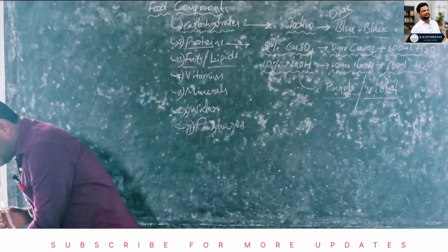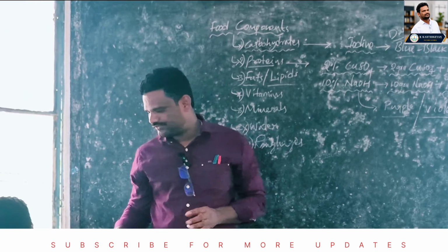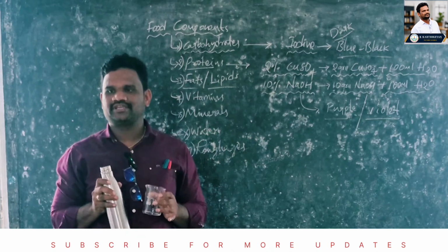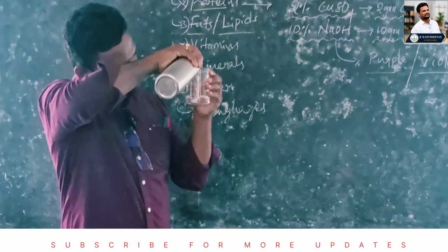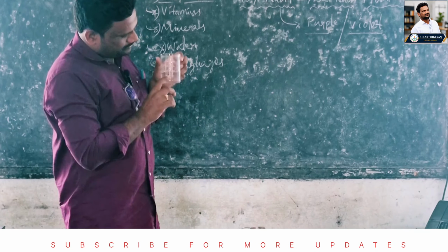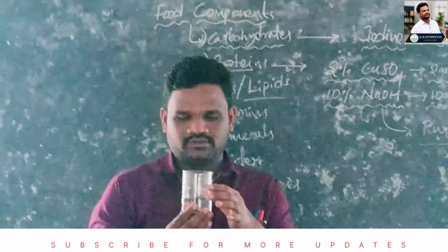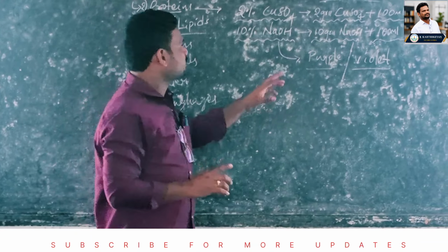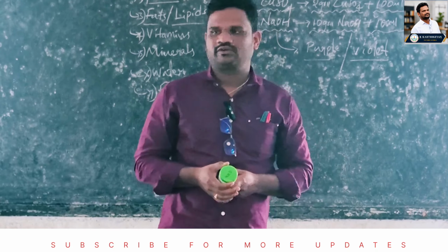Now, we need how much CuSO4? 2% CuSO4. To make 2% CuSO4, we need 100 ml of water. Open this. This is the 250 ml beaker. Here we have the 100 ml reading, which means we need 100 ml of water. We have 100 ml of water. Into this 100 ml of water, we have to add how much CuSO4? 2 grams.